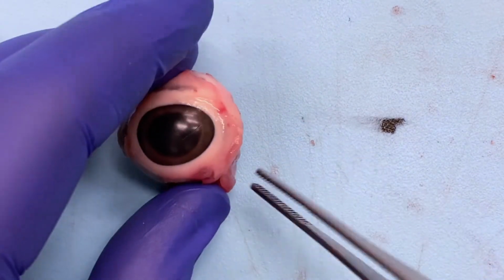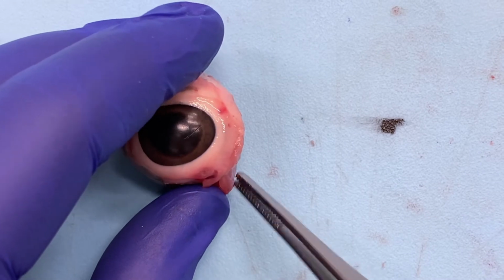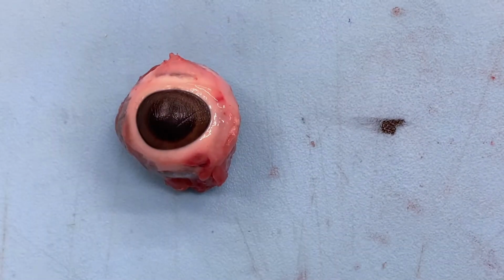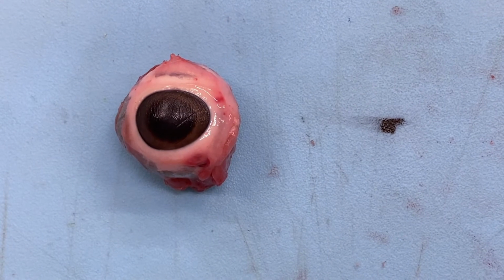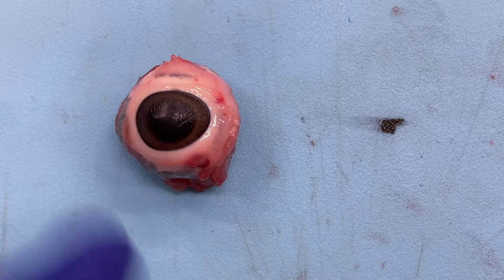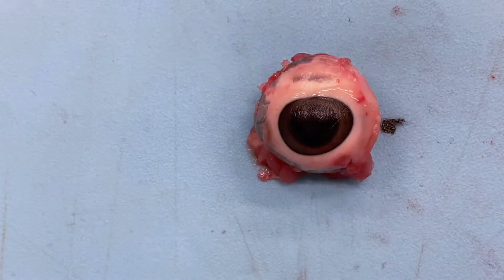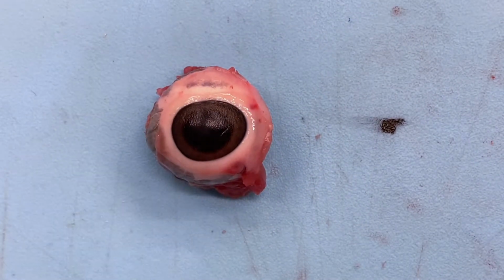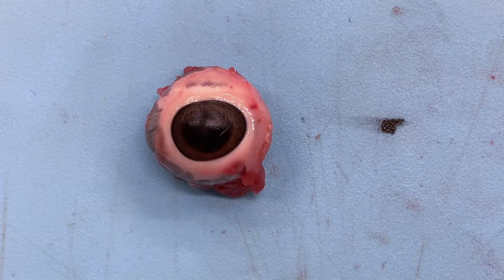Some places might try to even inject formalin or open these up to help fixation. That's a no-go. You want to just let it sit in formalin for the 48 hours, and that should be sufficient to fix everything inside and out. You don't want to make any injections into the orbit itself, and you don't want to make any incisions. Again, we don't want to disrupt that anatomy. So we will be doing this one fresh, but that is not typically the case. Just keep that in mind going forward.